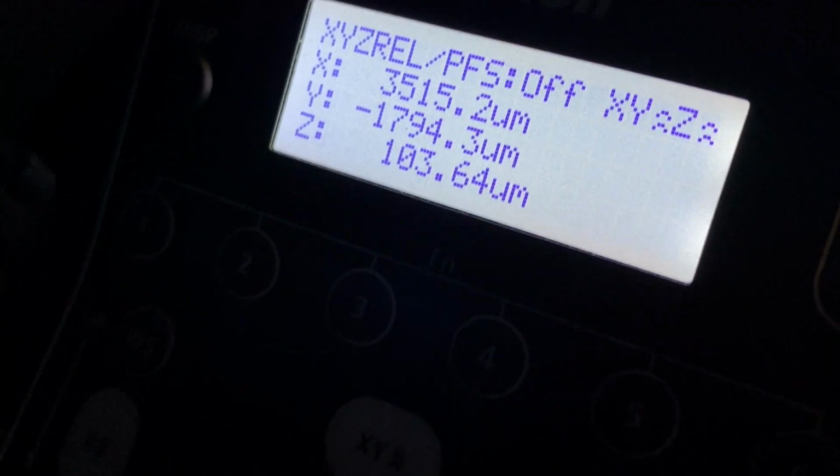Another good practice is when your lens is very close to the cover slip, like right now, if you cannot focus down the eyepiece on your sample, then please do not use the joystick to move around and look for your sample. Because what might have happened is you are already in contact with the lens and the cover slip, and if you move now, you might scratch the lens. Once it is in focus and you're happy with the location, we can move on to the software.